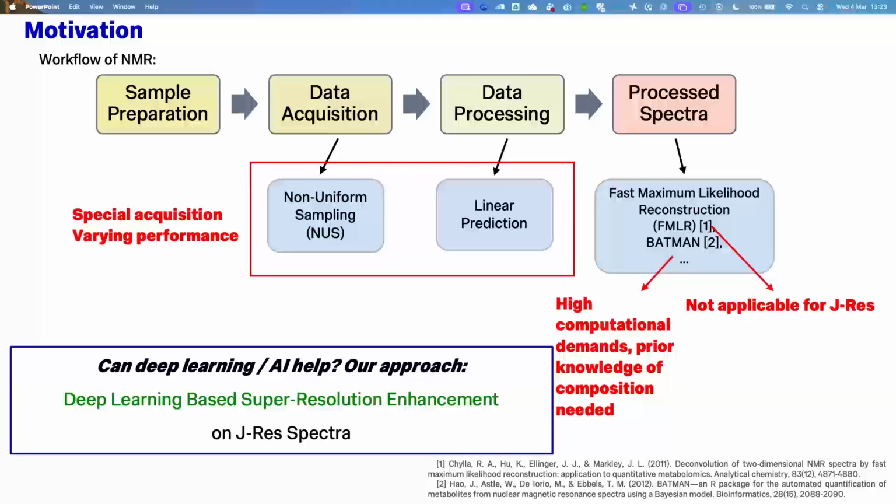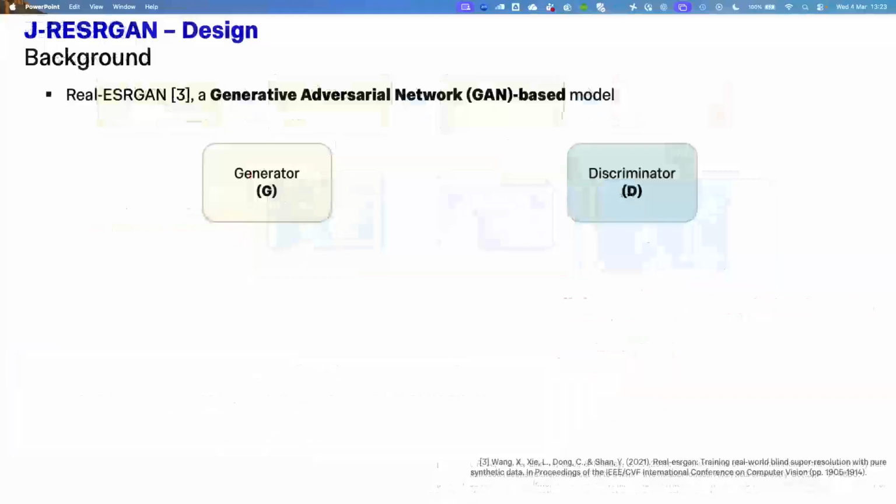And so we, of course, thought that maybe some of the deep learning approaches that were used in image analysis out there in the rest of the world could perhaps be used to improve resolution of these highly overlapped and crowded NMR spectra for metabolomics applications. So this is how we applied it. We're not deep learning specialists, so we took something that was relatively off the shelf.